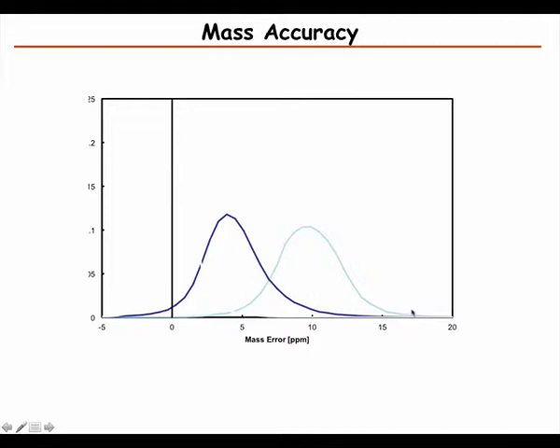But if you have a well-defined curve up here, of course you can recalibrate everything and move it down. And the nice thing is that if you do that, you can use a much smaller mass tolerance when you search, and you can also use a smaller mass tolerance like Jessica showed you with the MaxQuant.